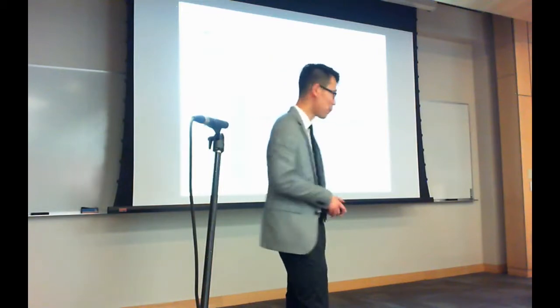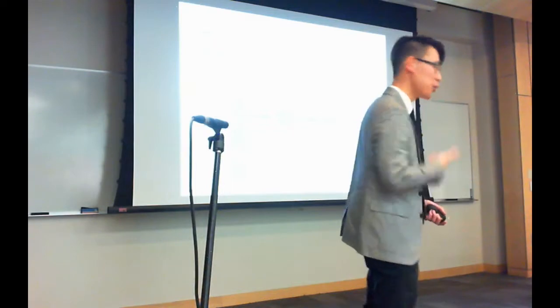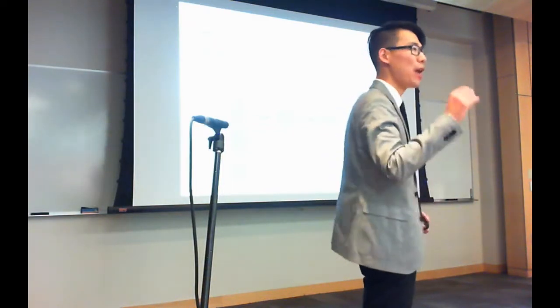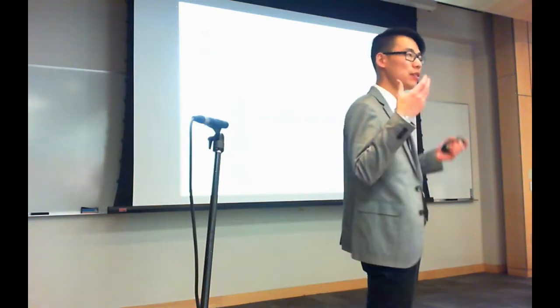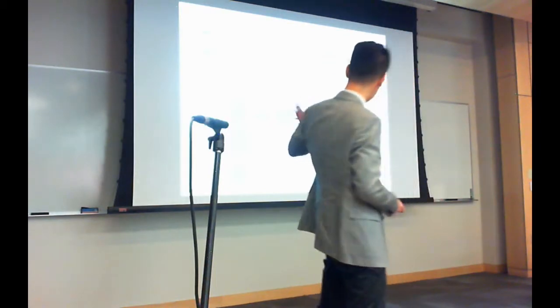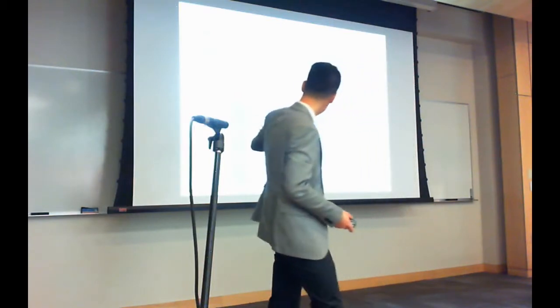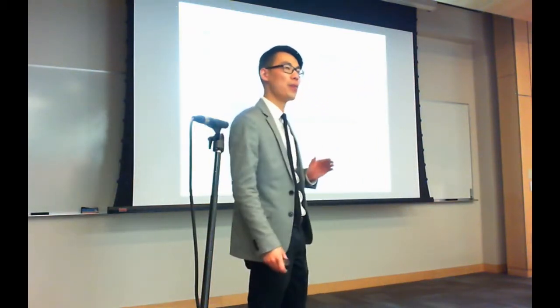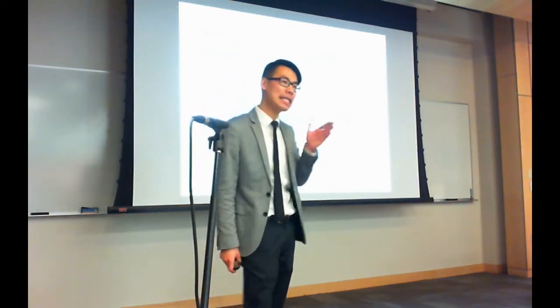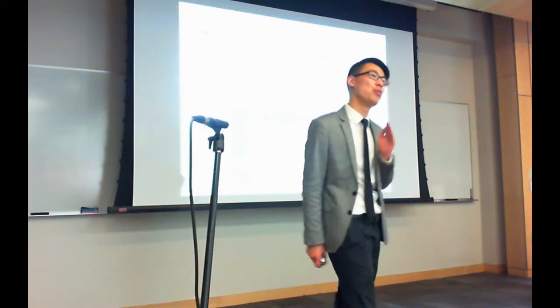And so we ventured to build a spectral library that is more comprehensive, that has all this provenance information, and has proper error controls. So if we're using it as a reference set, we can trust that it really is a reference set. And so to start off with, you need a lot of data. You need a lot of data. And so just to give you an example, there is a mass spectrometry repository in the UK called PRIDE. And it houses about 86 terabytes, approximately 88,000 LCMS runs of human proteomics data.